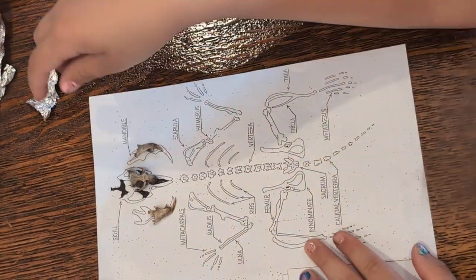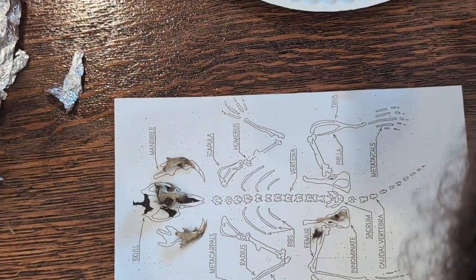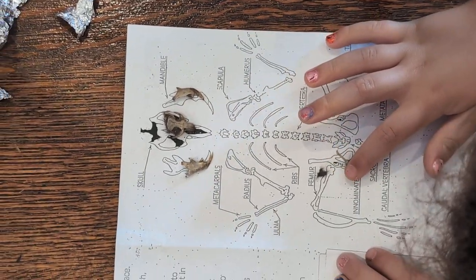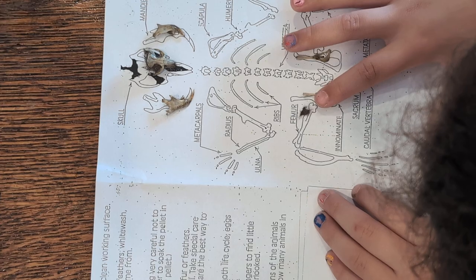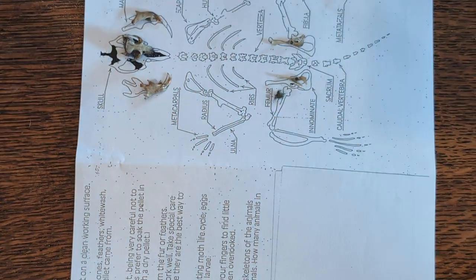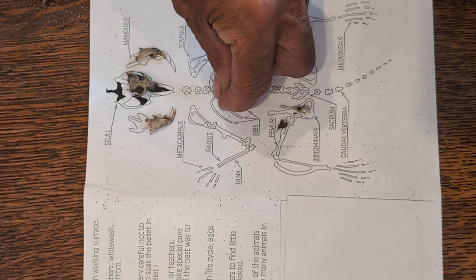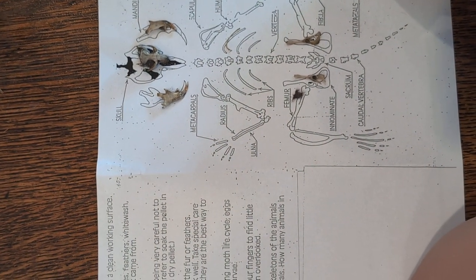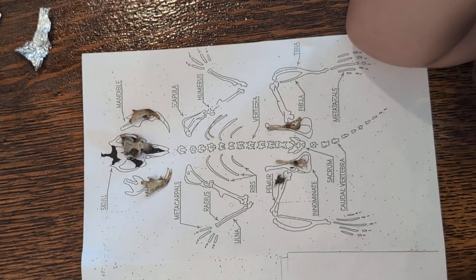Here's a hip bone — that bone right there. I don't see a shoulder blade; sometimes shoulder blades are there. That's another hip bone. Every animal has two hip bones. This is a rib bone, so there'll be — I believe 12 rib bones. I think mice have the same number of rib bones as we do: 12. And this is a shin bone.